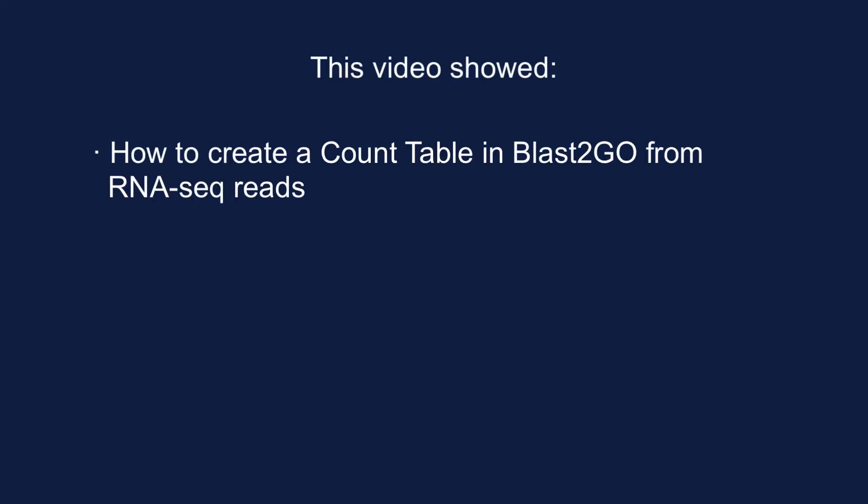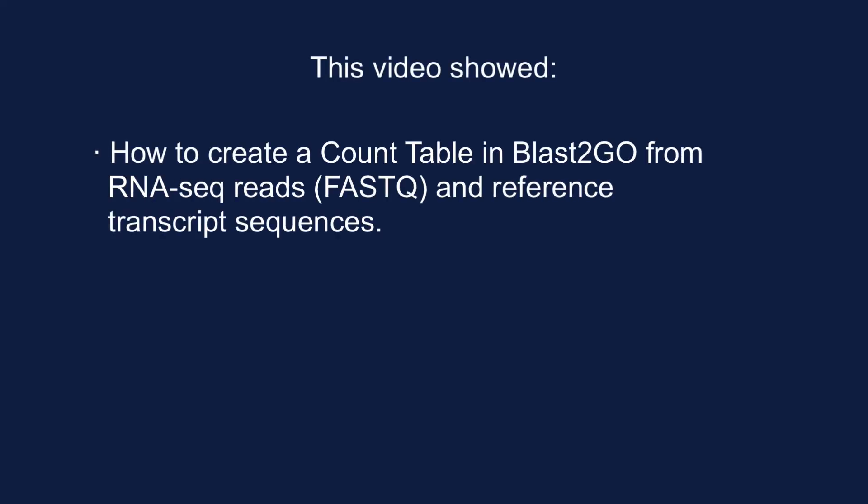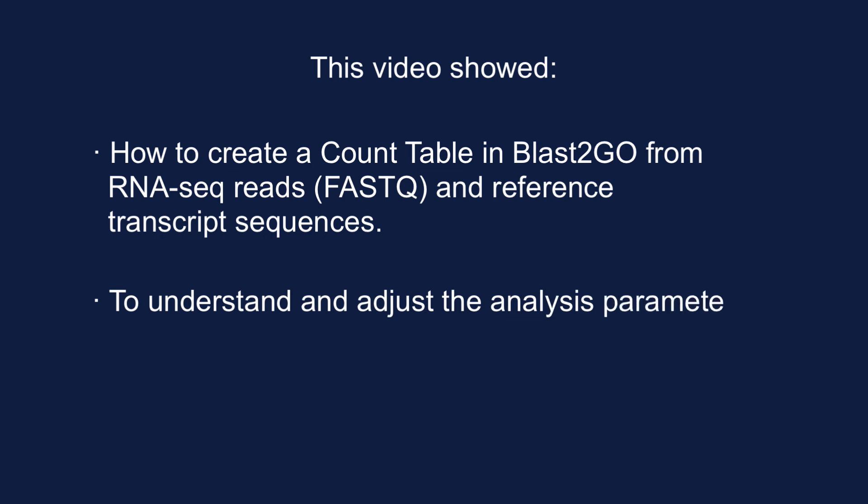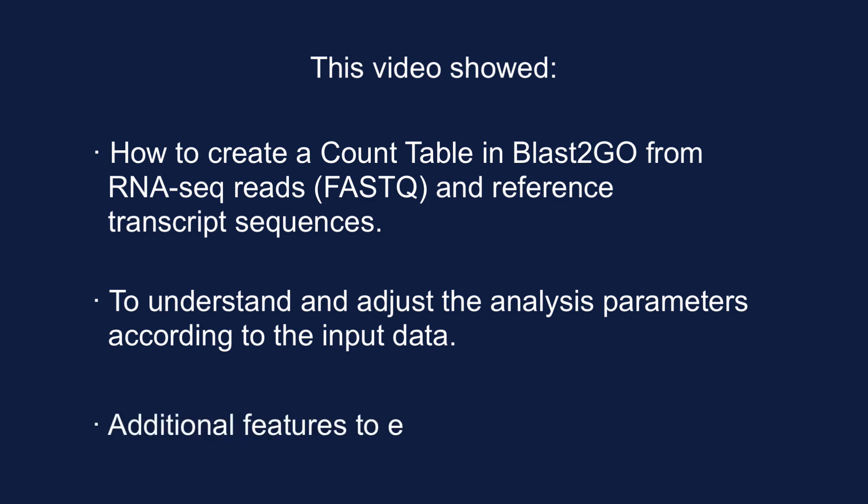This video has shown how to create a count table in BLAST2GO from RNA-seq reads in FASTQ format and reference transcript sequences, how to understand and adjust the analysis parameters according to the input data, and finally, some additional features to explore and evaluate these results.